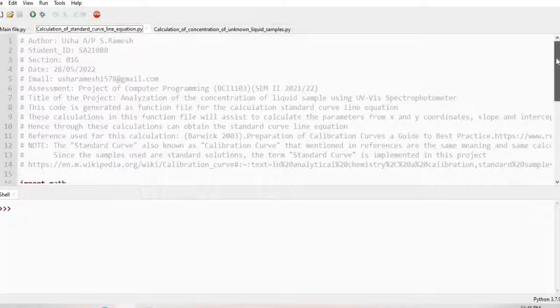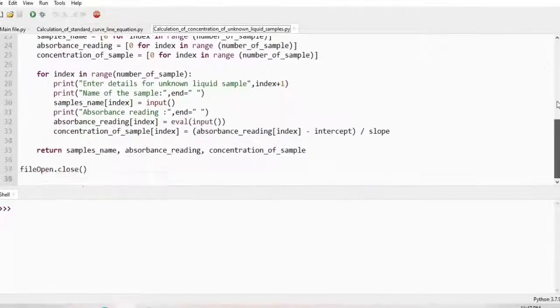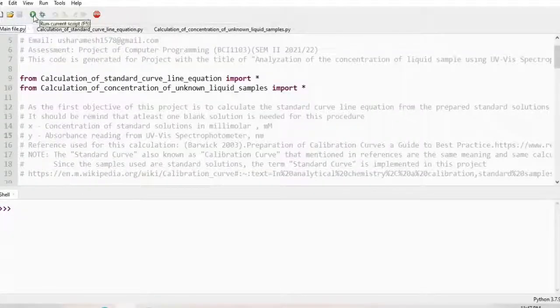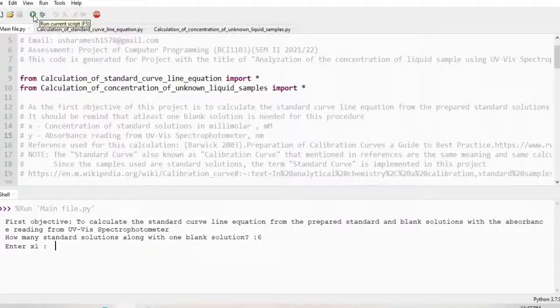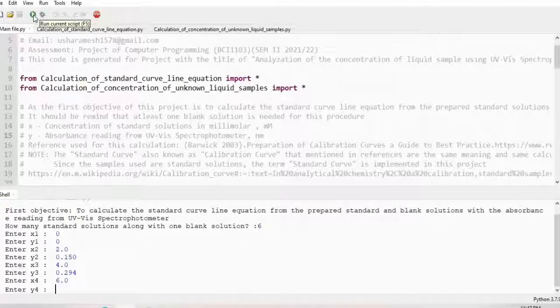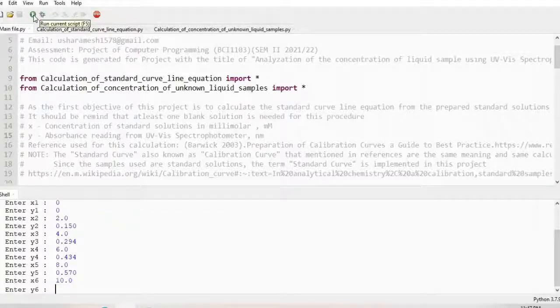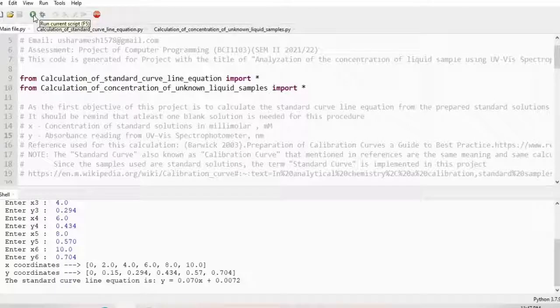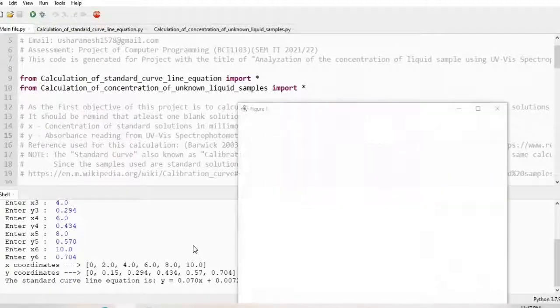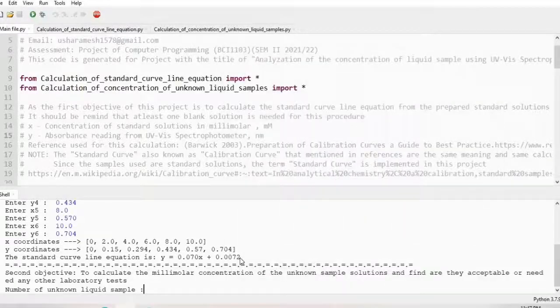So this is my second file which is the first function file and then this is my second function file. Through here we will get the graph of standard curve with the y equals to mx plus c, which is 0.070x plus 0.0072. So here this is how we got for the first objective.